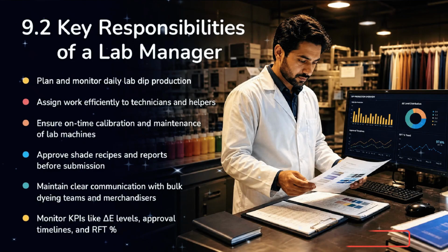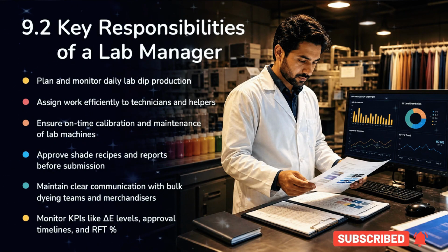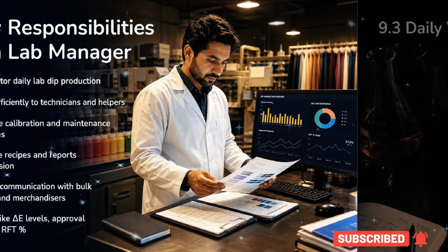A lab manager's key responsibilities include planning daily production, assigning tasks efficiently, maintaining lab equipment, approving recipes, communicating with stakeholders, and monitoring critical KPIs like delta E levels and turnaround times.